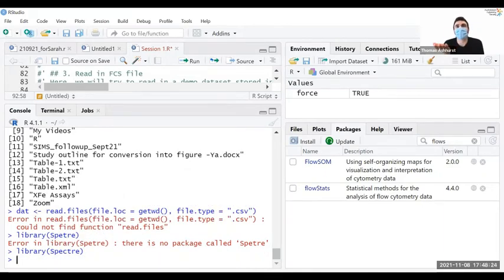Brilliant. It's really unintuitive. When it works, it doesn't tell you anything. Yep. If it doesn't work, it tells you something. So if you try that line again, at this point, that should work. I tried again, I think. Is it correct?